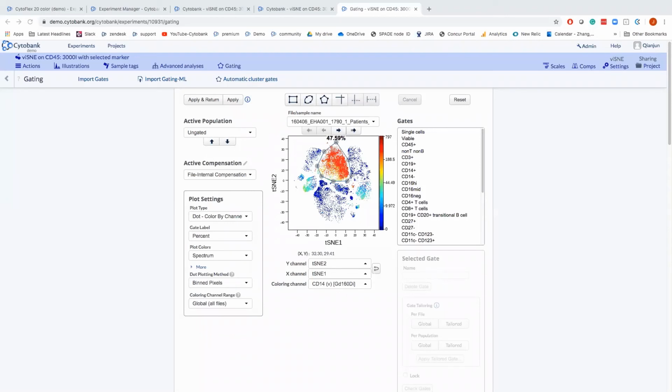And for the CD45 marker, because that was a marker in that data set, we used CD45 to do the pre-gating. So all the cells included in the viSNE run are already CD45 positive. Even if you include CD45, all the events will be positive, and the viSNE run will still try to identify low and high relatively, so you'll get a CD45 map with some lower expression and some higher expression.